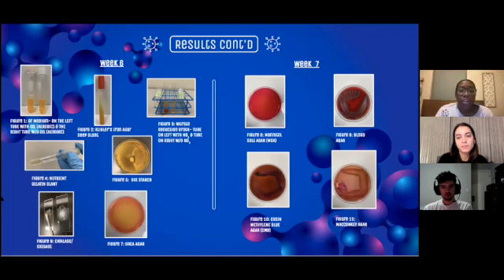And over to the right, we have our week 7, where only 2 of our tests tested positive, which was the eosin methylene blue agar plate and the MacConkey agar plate. And the MSA plate, as well as the blood agar plate, were both found to be negative. And the EMB plate, there was gram-negative lactose fermenting bacteria on that plate. And on figure 11, on MacConkey agar, the pH was acidic and there was gram-negative bacteria on the plate.